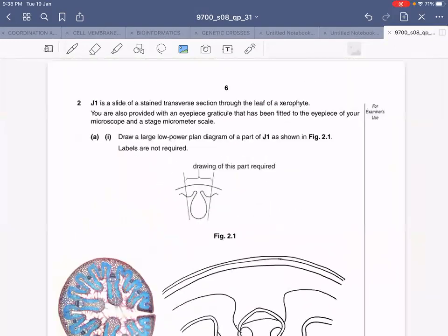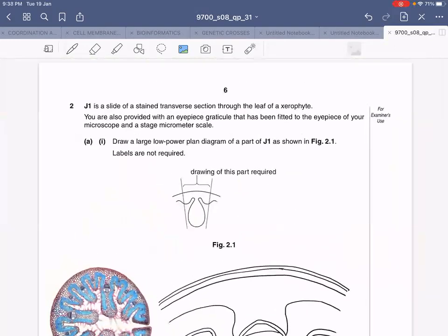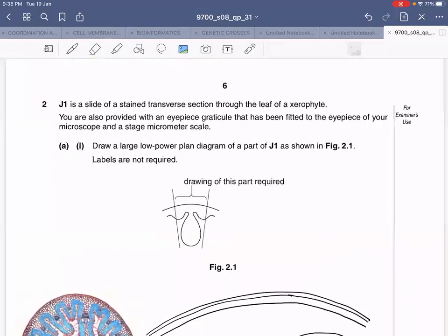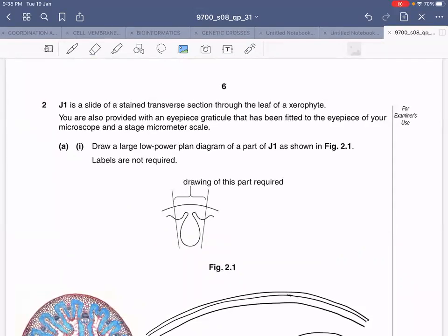The question says J1 is a slide of a stained transverse section through the leaf of a xerophyte. A xerophyte is a plant that grows in a desert. You are also provided with an eyepiece graticule that has been fitted to the eyepiece of your microscope and a stage micrometer scale. I'll show you these two things afterwards. First let's get done with the plan diagram.